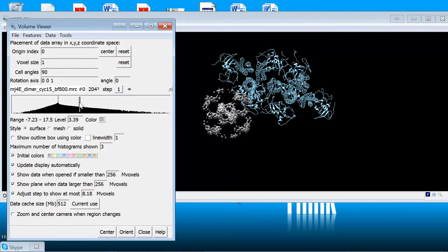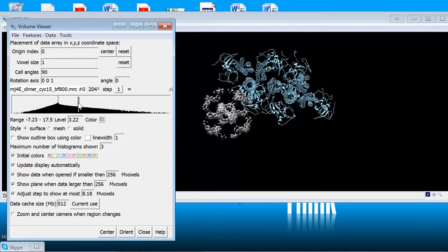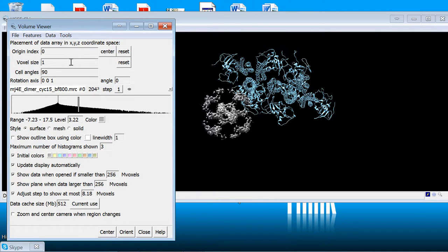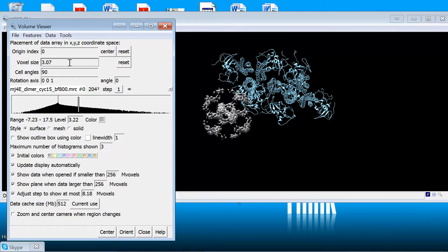So obviously the scale isn't quite correct here. Generally speaking you're going to receive an EM map that's probably going to have the right pixel size set. If it's not, under your features you can open the coordinates menu and when you have coordinates open you can change the voxel size to the correct pixel size.